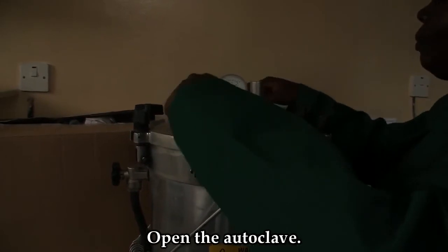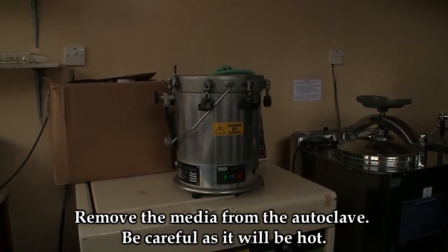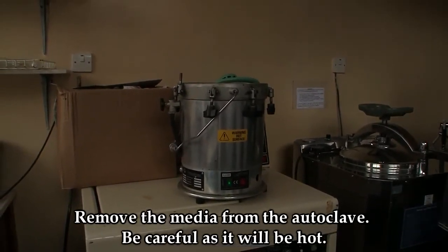Open the autoclave. Remove the media from the autoclave, but be careful — it might be hot.